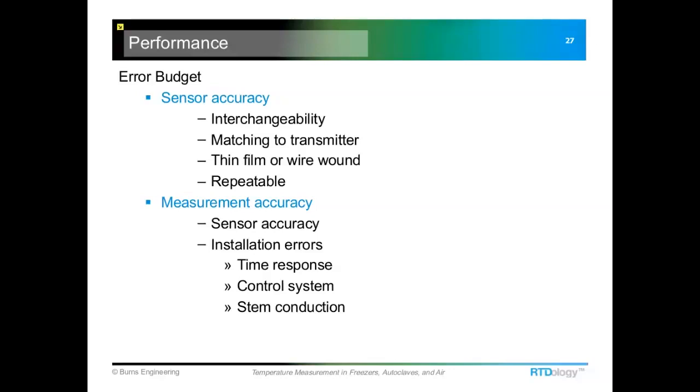On the autoclave side, you have a vacuum that's being pulled, but typically there's pressure applied with the stress test chambers. So that would potentially change the design of the sensor, because you need to make sure that you're able to account for that additional pressure, depending upon what that pressure is.